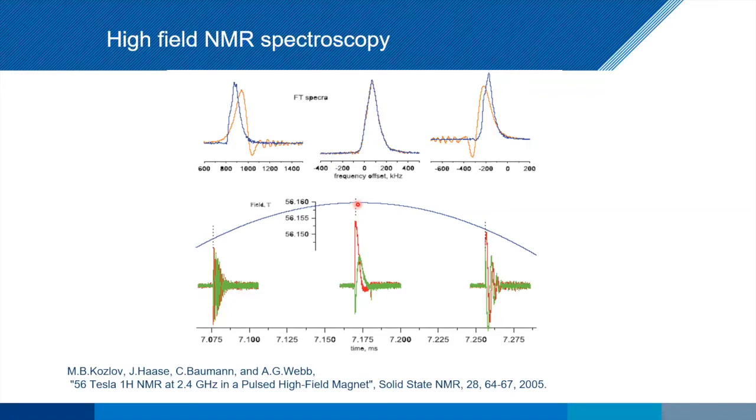And then, of course, our TR here is about 5 hours because the magnet has to cool down from about 300K all the way down to superconducting again. And so we catch it on the way down over here. And so here we're able to actually measure some relaxation times, believe it or not, even though this is on the millisecond scale. And this was some work we were doing with the solid state chemists over there.